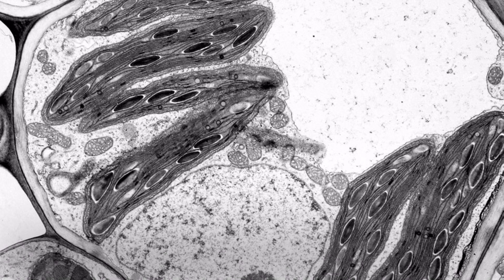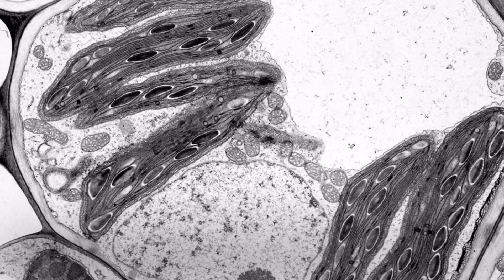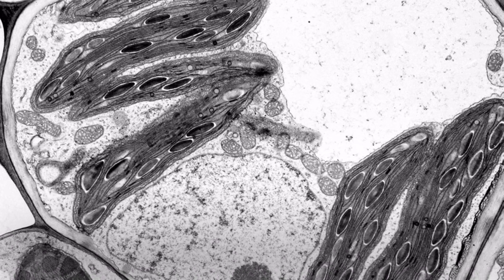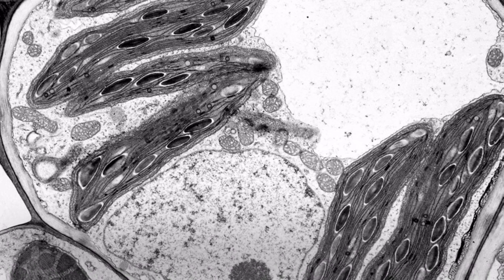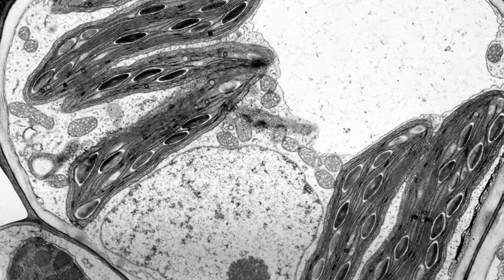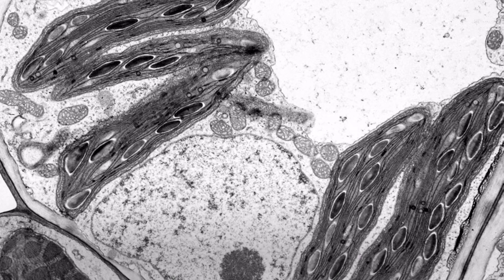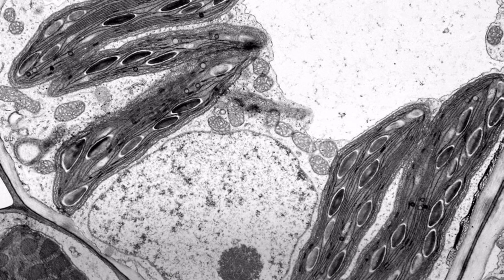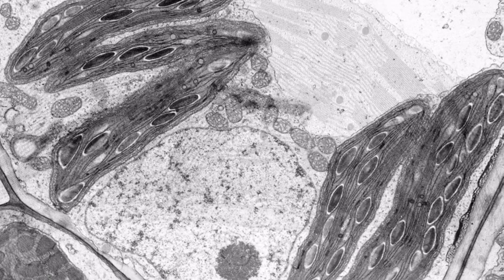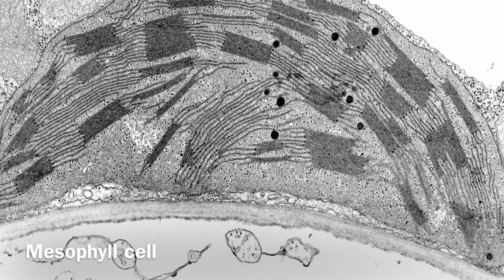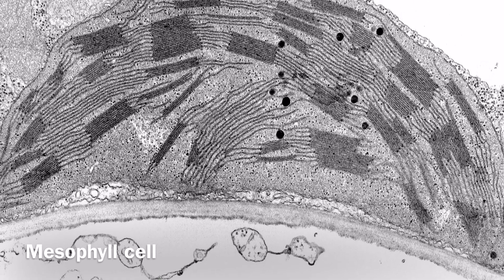In this electron micrograph, as well as seeing the nucleus and mitochondria, we see a significant number of chloroplasts. The chloroplast is the site of photosynthesis, and this suggests that this cell is a mesophyll cell from a plant's leaf.